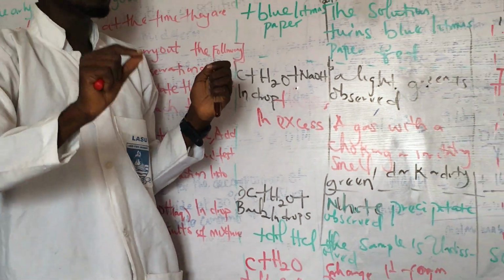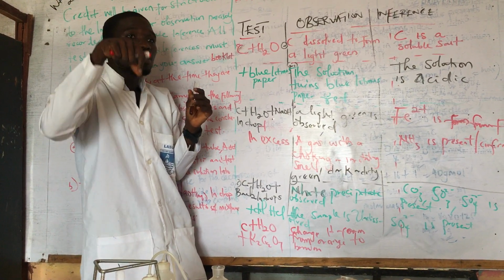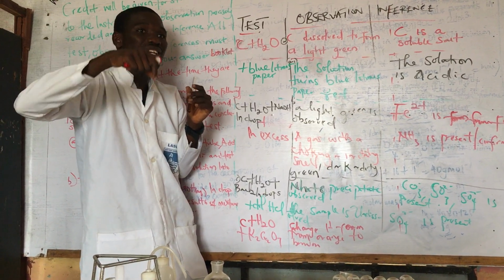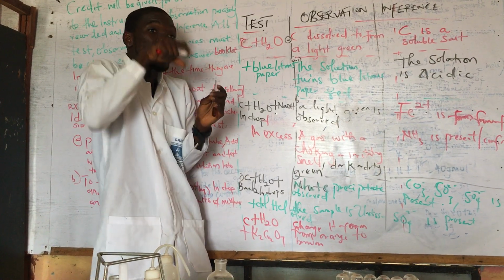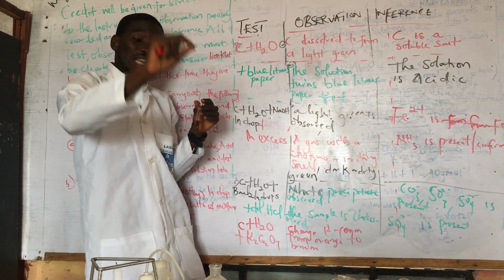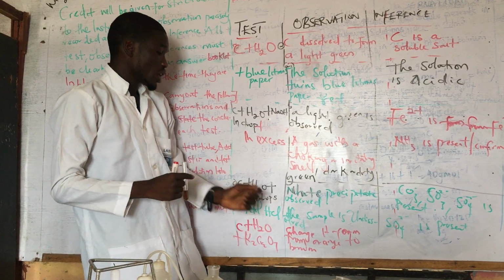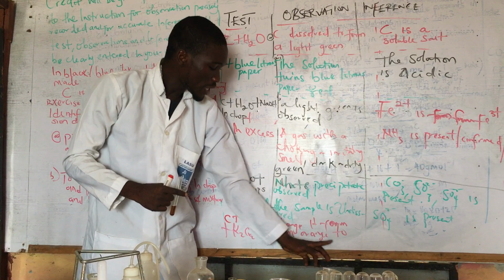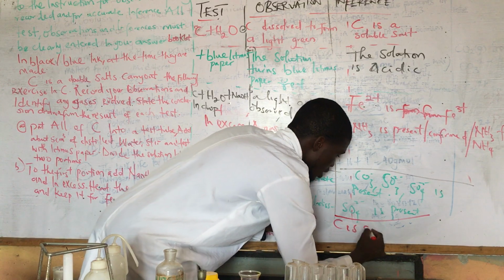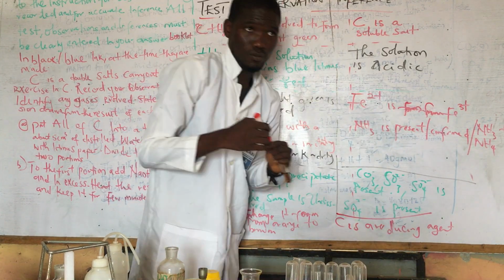If when you pour the potassium dichromate into this, it does not change its color, automatically that potassium dichromate is a good oxidizing agent itself. So if it is not changing its color, it means that the potassium dichromate still retains its oxidizing state. But for you to have put your potassium dichromate into the test tube with sample C plus water, it changes its form from orange to brown. So I can say C is a reducing agent. Are you with me now?